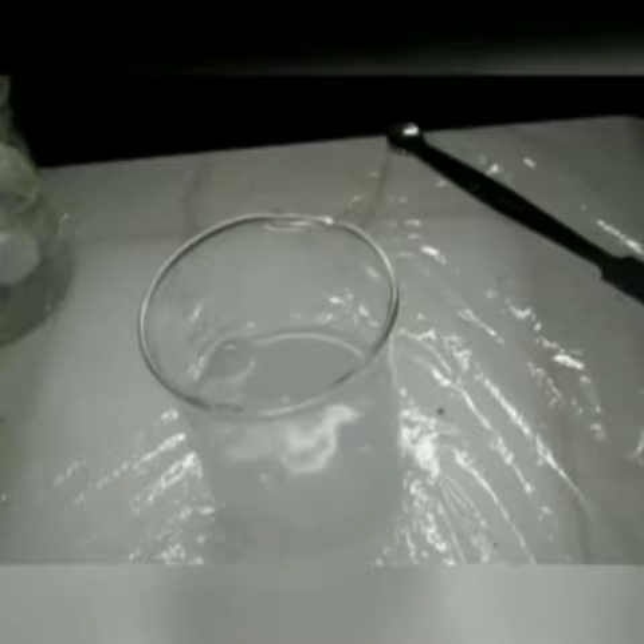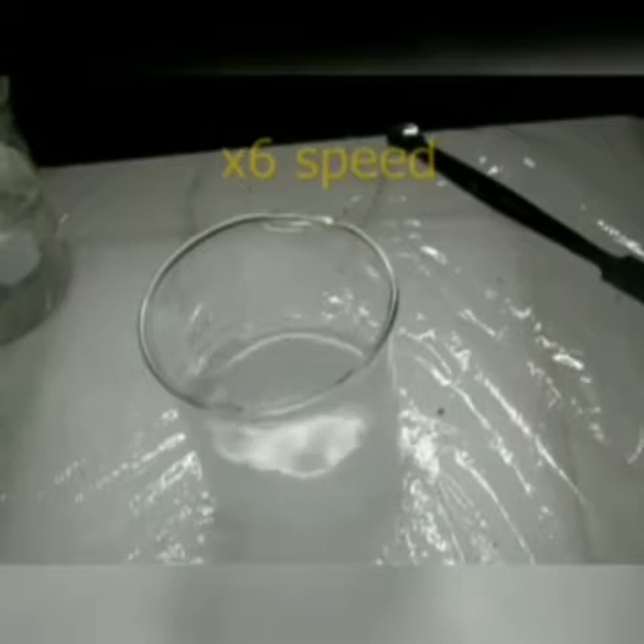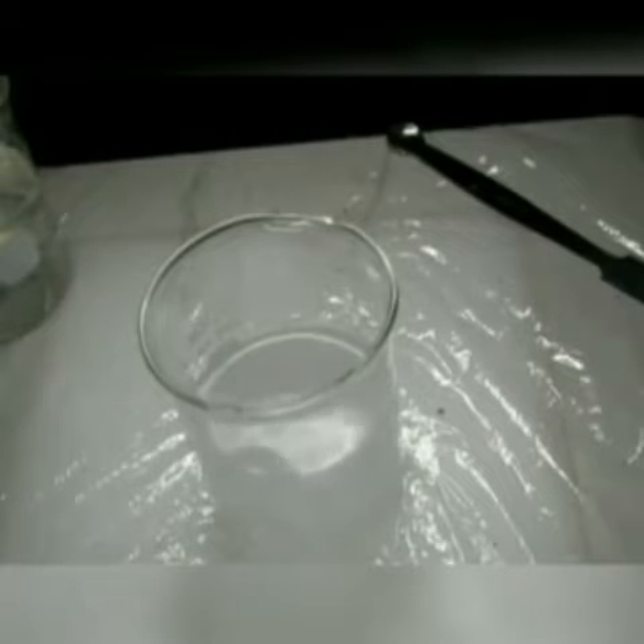The solution here is becoming cloudy — it's becoming hard to see — and that's just because there are so many bubbles in there, primarily. There is a little bit of a solid precipitate being formed, but mostly it's the bubbles. The bubbles you see are a gas being given off, and it turns out that gas is hydrogen gas. The movement is coming from the gas bubbles being given off — it's basically like a little motor or rocket on it; the gas bubbles are just pushing it around.